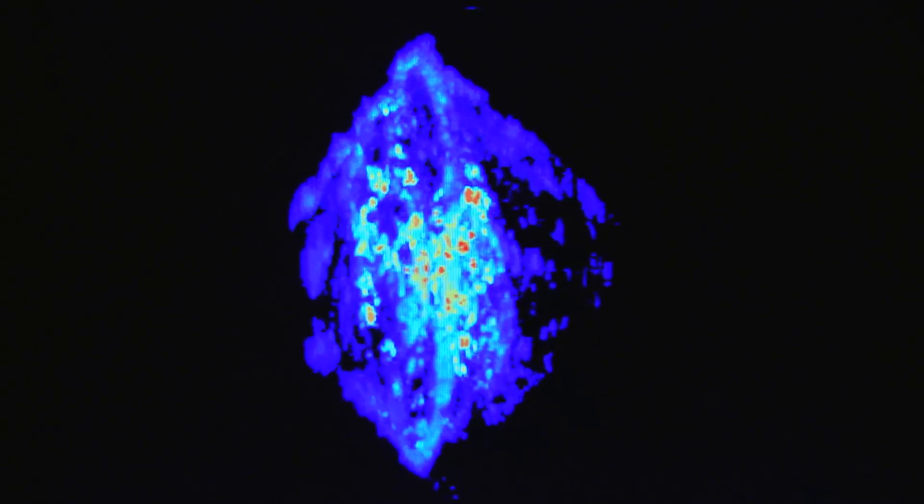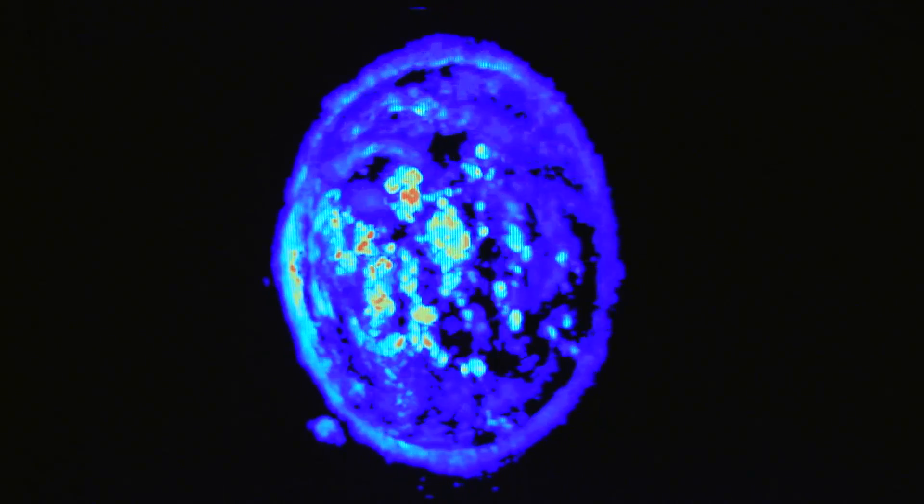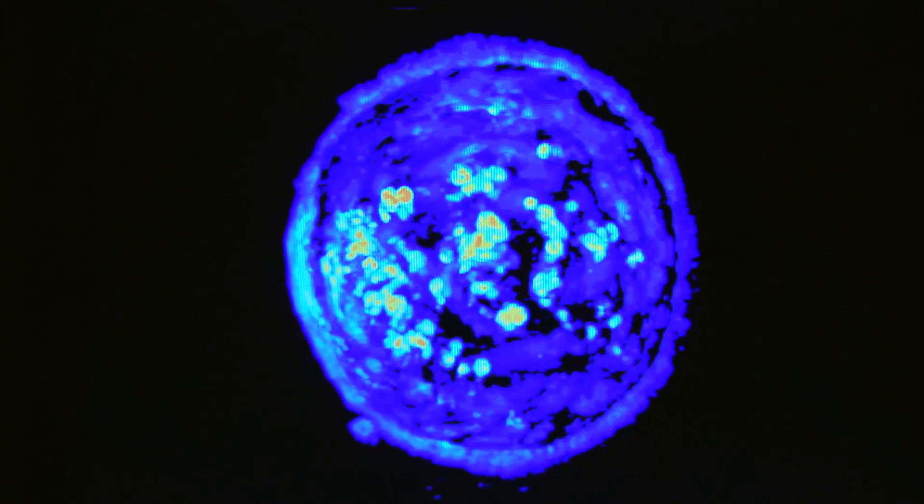Now, a new imaging technique that needs no dyes or chemicals creates amazing 3D images with living cells. We do that using visible light, so light that does not damage the cells.